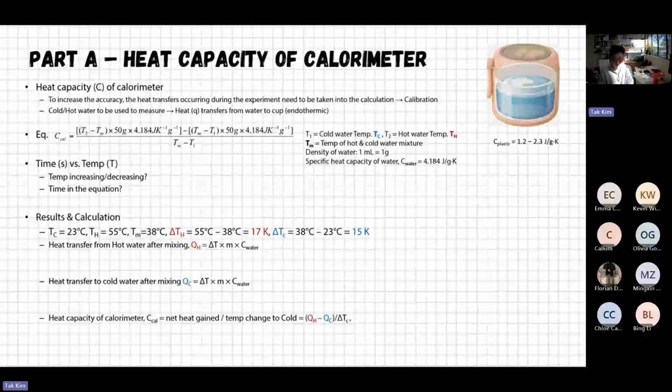The reason is that measuring energy directly is really difficult. So what we do is take the initial temperature and then the final temperature, then we find out the differences. We can always calculate changes in energy from that. So that is what we did.